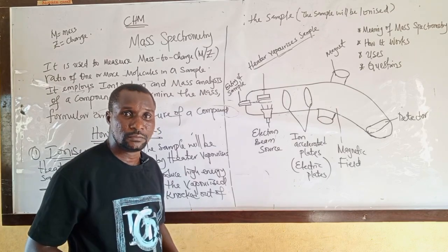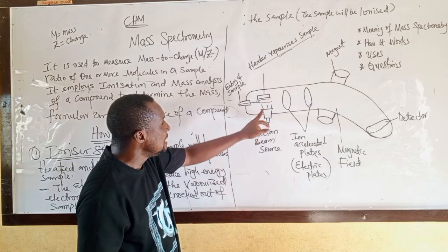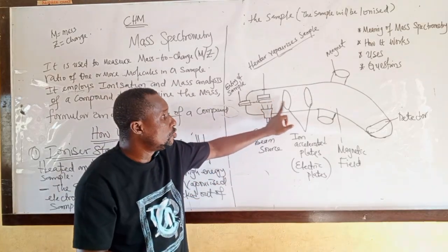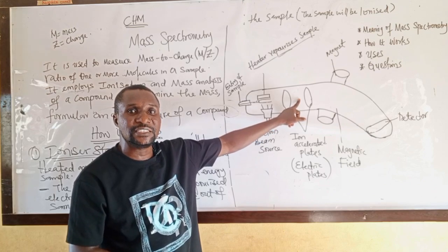It will be ionized. Take note. Then the ions will be accelerated through the ion accelerating plate. That is the second stage.